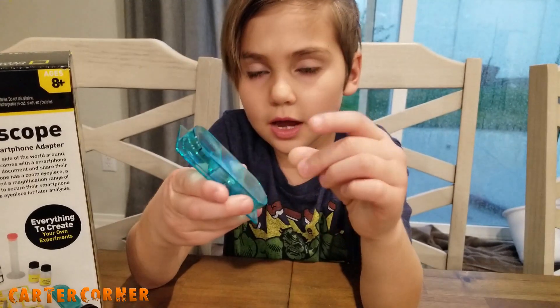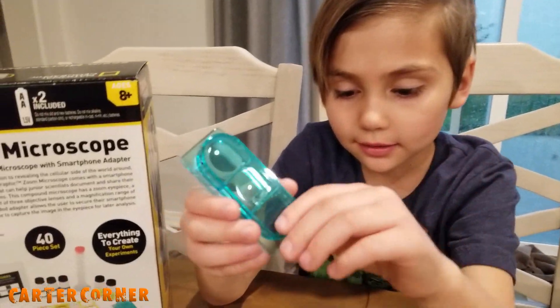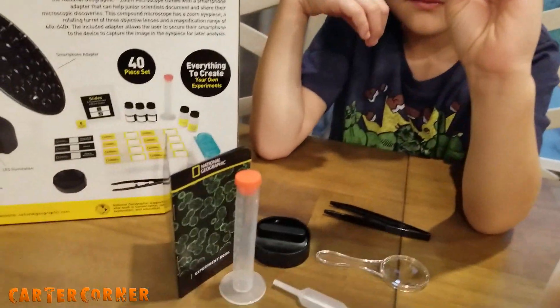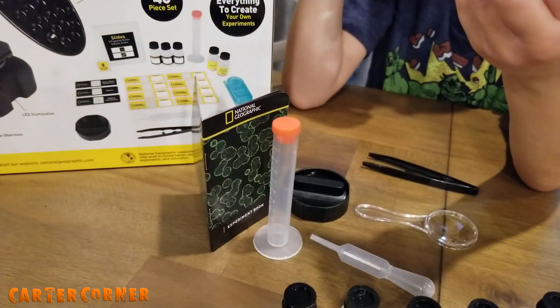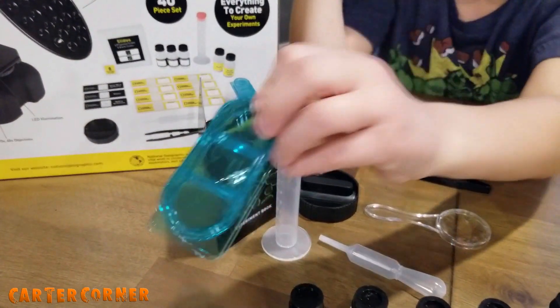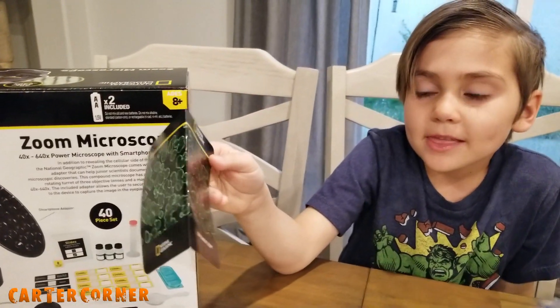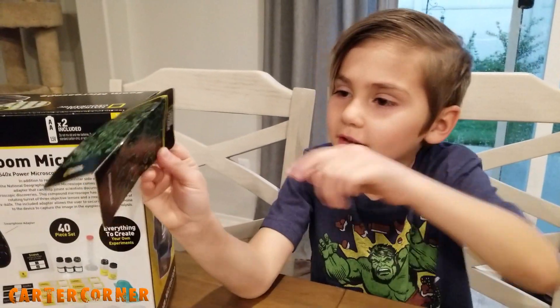This is to hatch the brine shrimp eggs and hatch them in there. That's for some of the experiments that come with that experiment book right there. They gave us some experiment ideas. This is the experiment book.